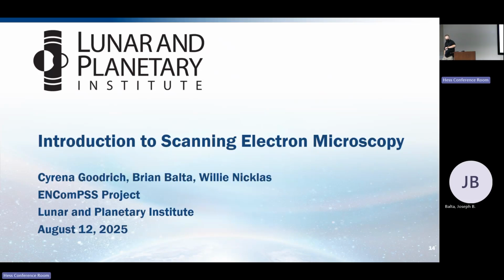So the rest of the morning is going to be mostly me talking at you with some interjections by the other two, giving you an overview of electron microscopy, specifically scanning electron microscopy. This will get us all the terms down. This will get us how everything works down.